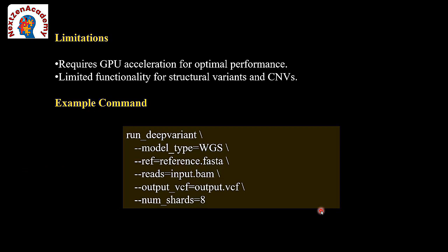It is also helpful if some people are not able to download GATK or FreeBayes, they can work with SAMtools or BCFtools, sorry, BCFtools.